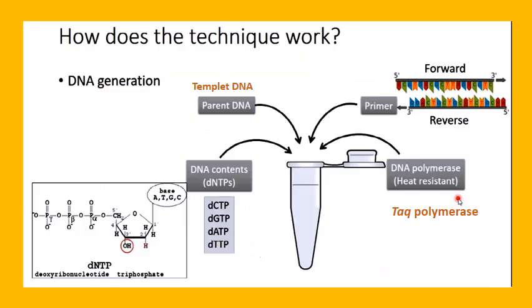selected copies. We will study how the technique works in PCR. This is the most important technique, which leads to DNA generation and formation of new copies of DNA.